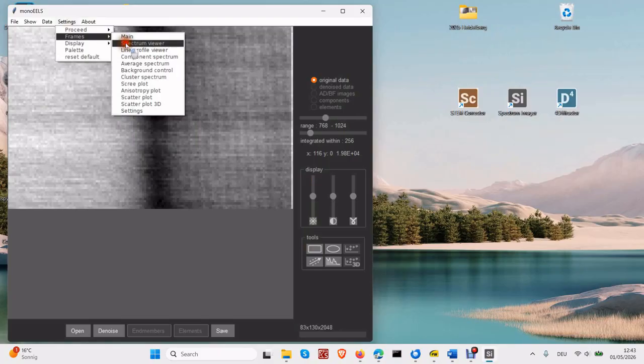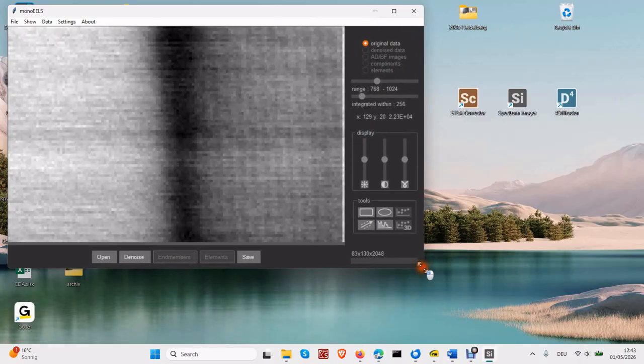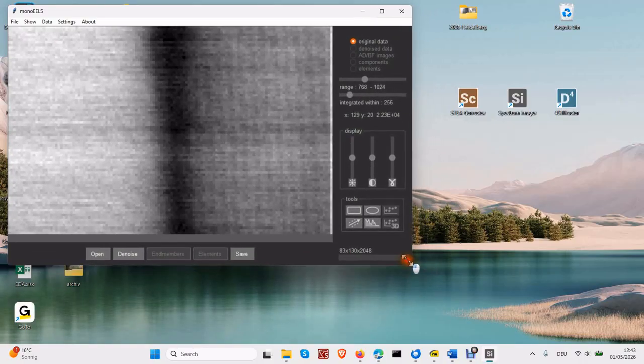You can also choose where the frame appears, either to the right of the main window or below it. Type bottom. Probably we resize the main frame for convenience. One can change it by dragging with a mouse.